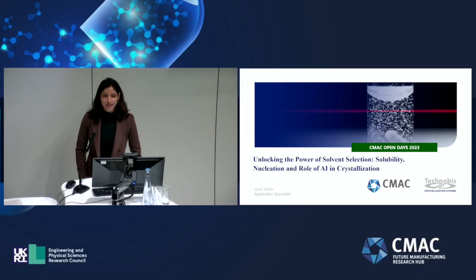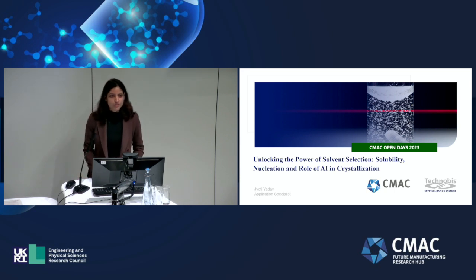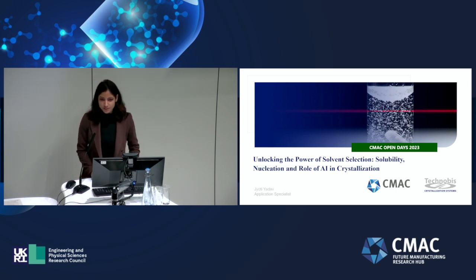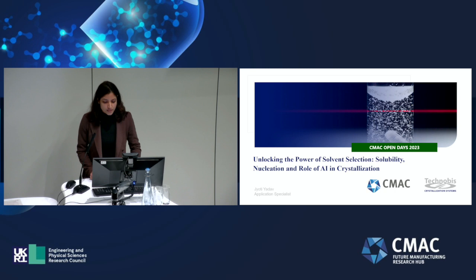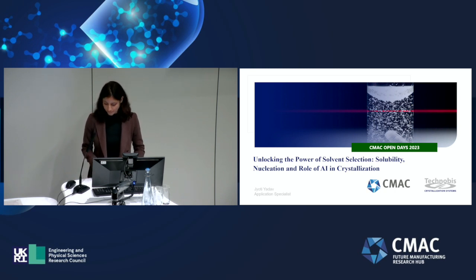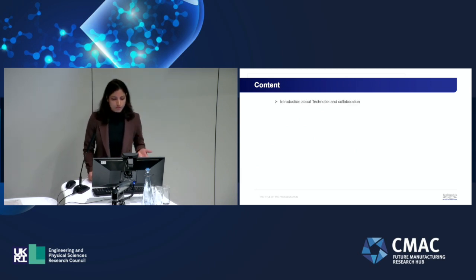Good morning, everyone. I am Jyoti, application specialist from Technobis Crystallization Systems. Today in this session of translation to industry, I would like to focus on selection of solvent and talk about unlocking the power of solvent selection, solubility, nucleation, and role of AI in crystallization. During the presentation, first, I will give a brief introduction about Technobis and the collaboration with CMAC.